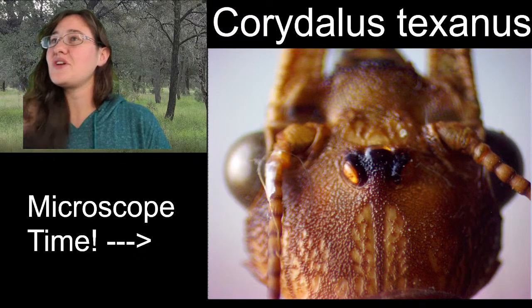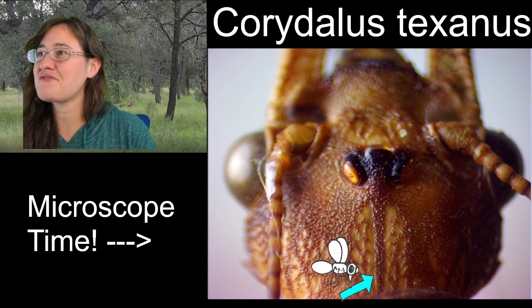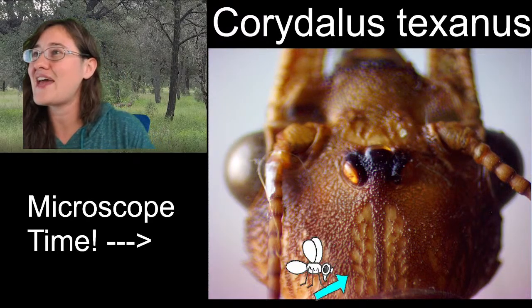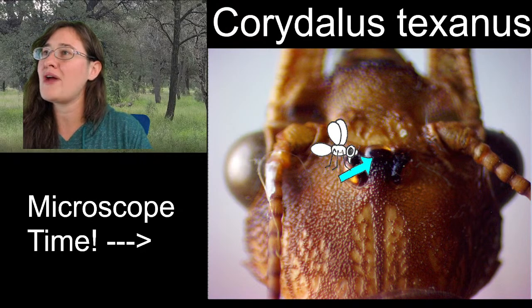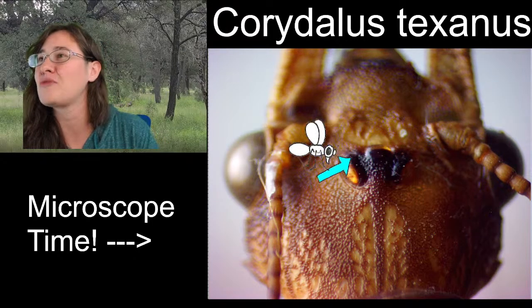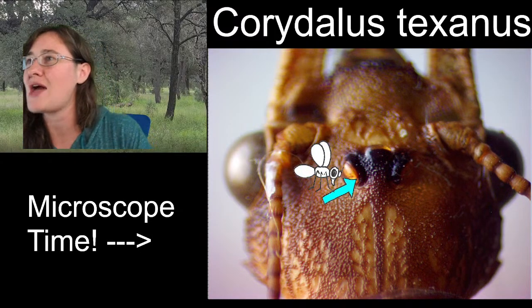I love this region of the head right here and here. It almost looks like somebody was chiseling out of its head a little bit. If you go here all the way up to the point, there is actually an ocelli, a simple eye, that's facing forward at the end of that hill right there. So we have an ocelli here, an ocelli here, and then one going forward. So there is a triangle of those happening here.